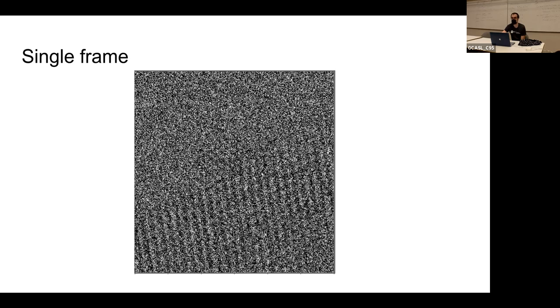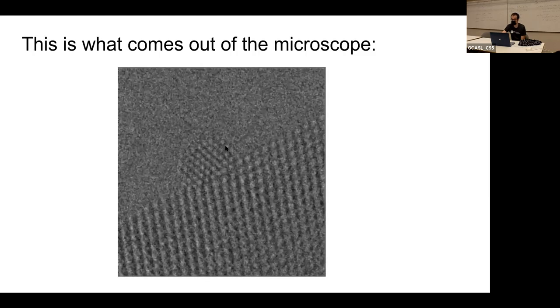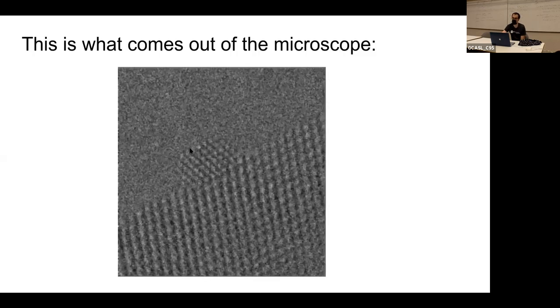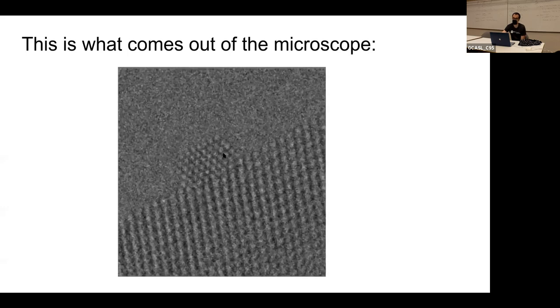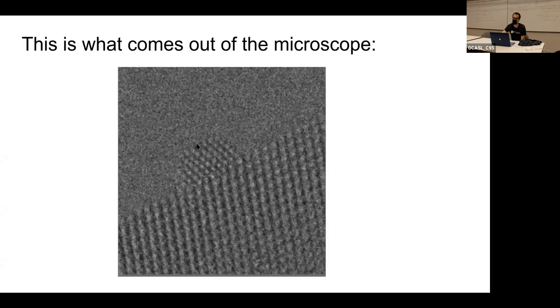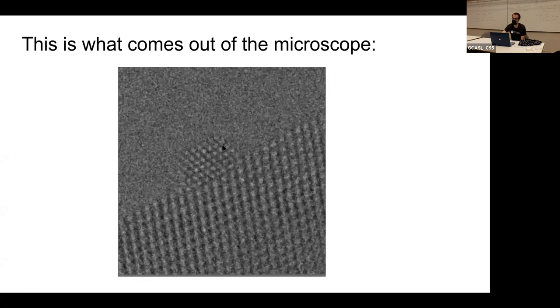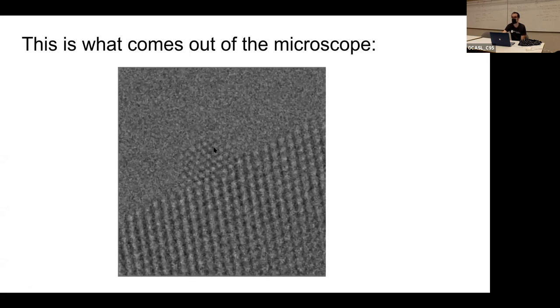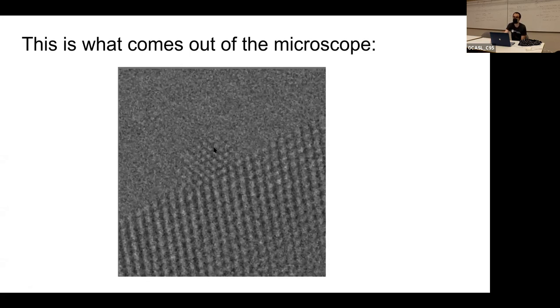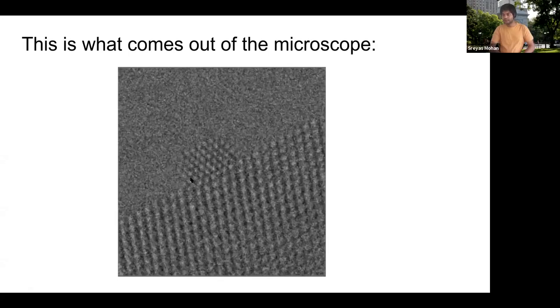Does the smoothing cause that? It looked like there was a box. It kind of looks like an edge almost. This is a nanoparticle, which is what actually does this catalysis. They're really interesting. This is a platinum nanoparticle that is sitting on a support of atoms. And this thing actually is what induces chemical reactions. It's the catalyst.